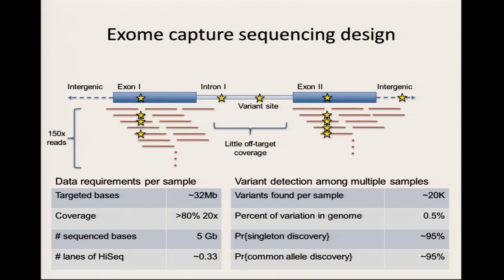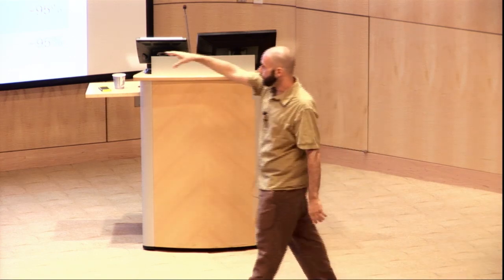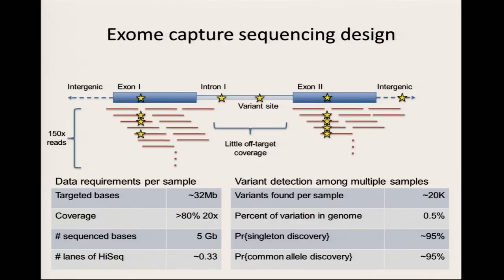But what ends up happening in practice is that the majority of the exome is covered to like 100x. It's just some of them are very hard to capture, and so you have to bump that way up in order to capture those hard to capture ones. So these numbers are for 1 human sample. The exome in some other organism is going to be a different size, for example, and the amount of variance that you find is going to be different, things like that.